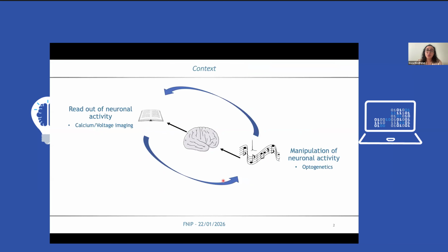Okay. So Valentina's lab focuses on developing optical tools for manipulating neuronal activity via optogenetics, by photoactivating or photoinhibiting neurons, and for reading out neuronal activity using tools such as calcium or voltage indicators. And so my role in the lab, as well as my fellow biologists, is to test these tools on biological samples to characterize their performances and to demonstrate their usefulness.